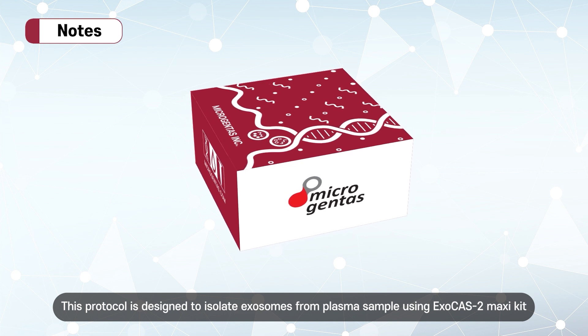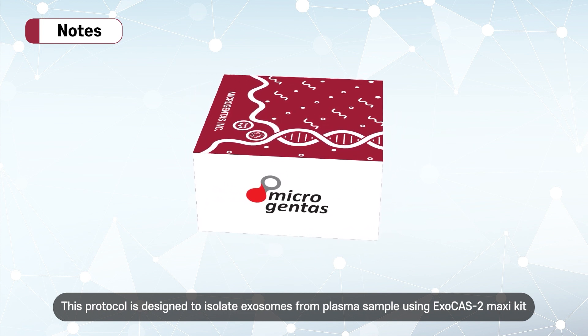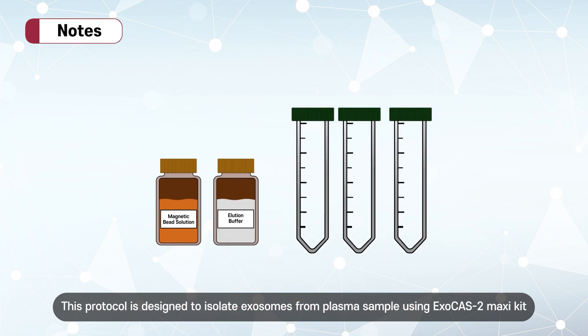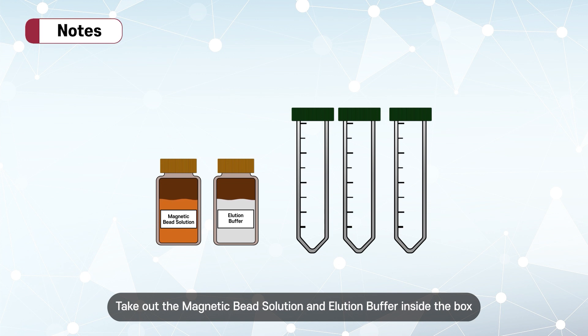This protocol is designed to isolate exosomes from plasma sample using EXO-CAS-2 Maxi Kit. Take out the magnetic bead solution and elution buffer inside the box.